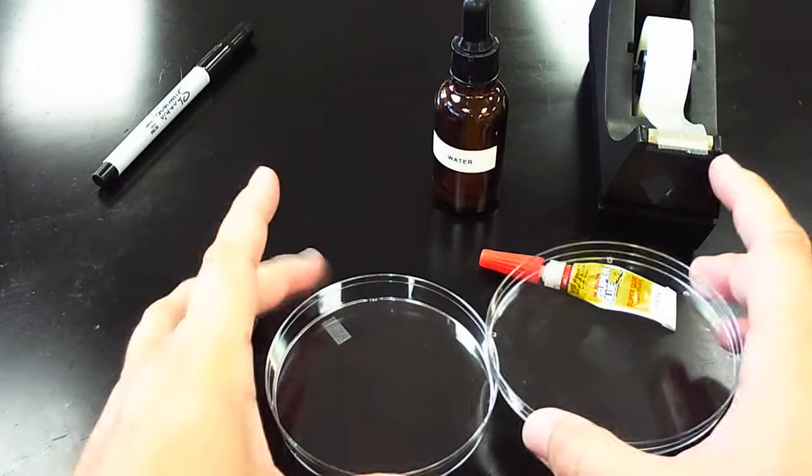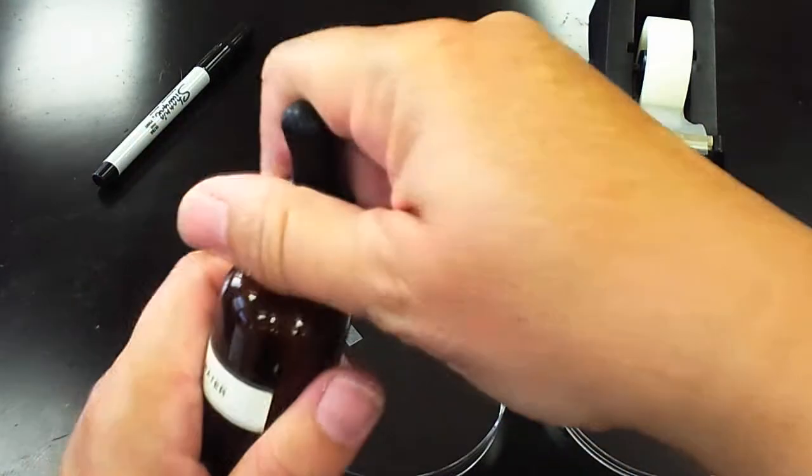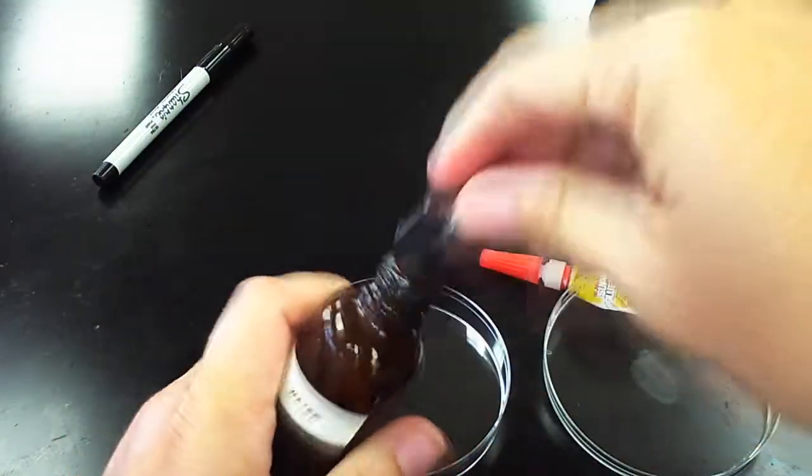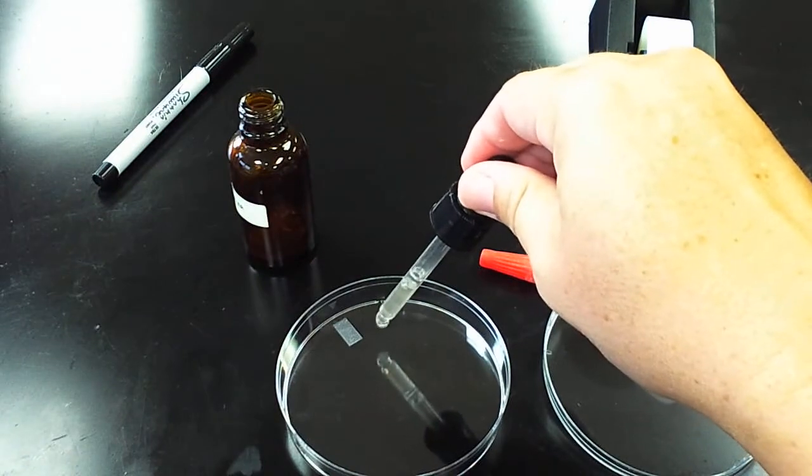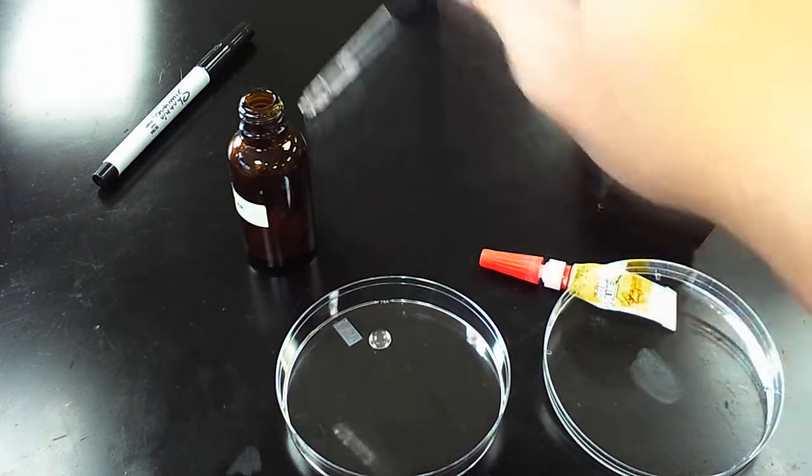In the bottom of the petri dish, on one side you're going to place a couple drops of water, just two really.